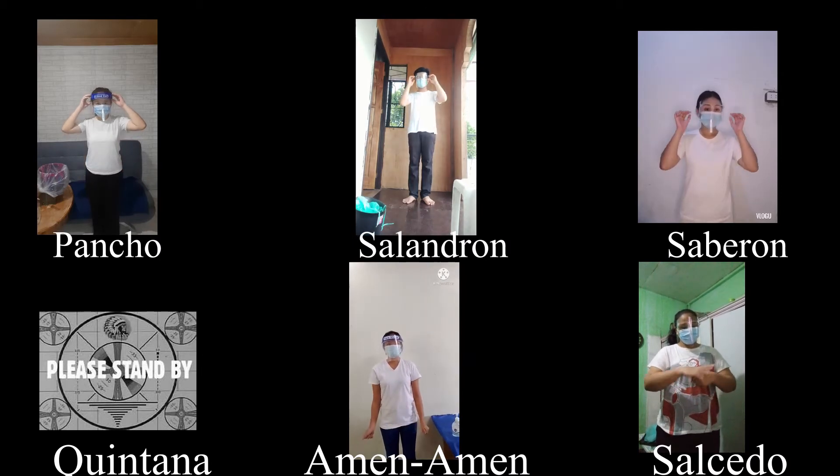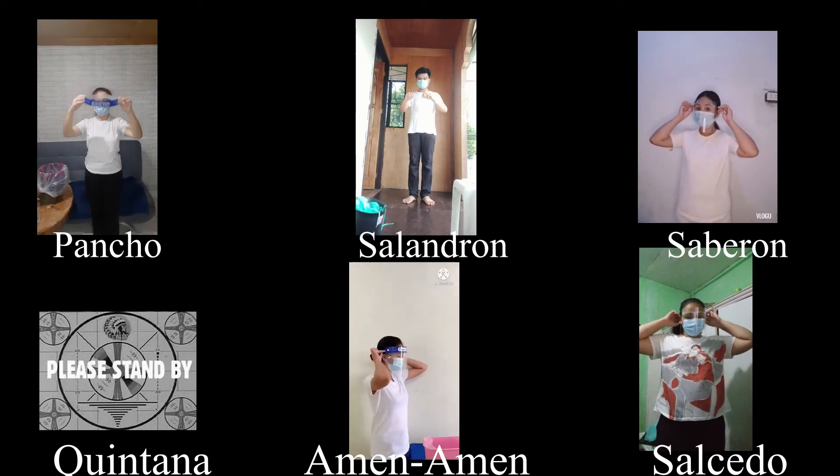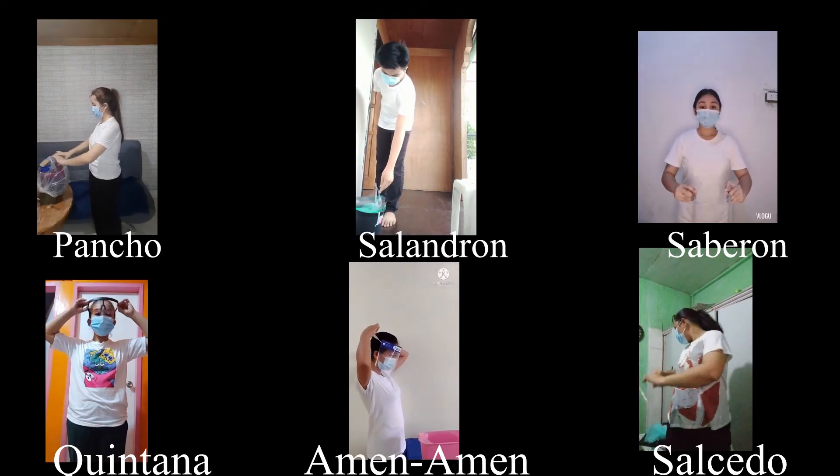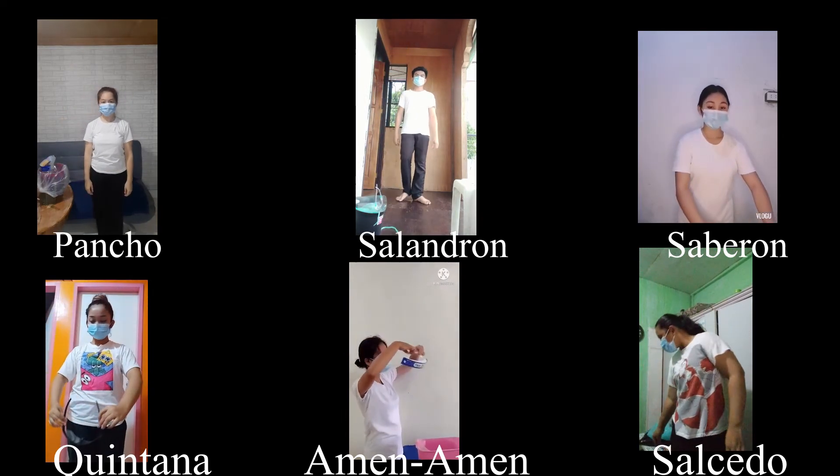Carefully remove the face shield or goggles by grabbing the strap and pulling upwards and away from your head. Do not touch the front of the face shield or goggles.